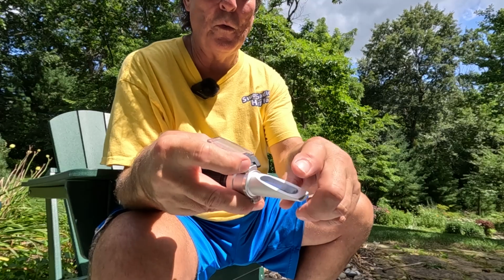So you take a frame. I don't have a frame to show you, but you take a frame that's full and basically dig into it and get a finger full of honey, which is the way I do it. There may be other ways. People may take tools or whatever, but I just take my finger, get a big hunk of honey, make sure that there's no wax or anything on it, and then basically you wipe it across.